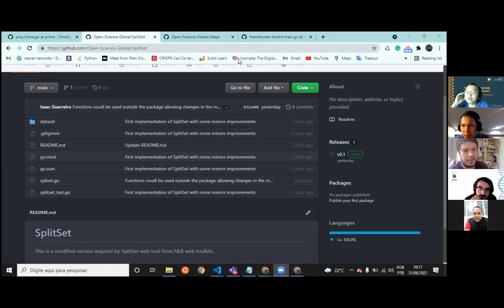Yeah, I think we'll be mostly using de novo assemblers because if there's not much alteration in the plasmid, then we'll be using a reference-based approach, but if many alterations are to be made, then I think it's better to use de novo. De novo. Okay, I'll try to take a look at the de novo assemblers.